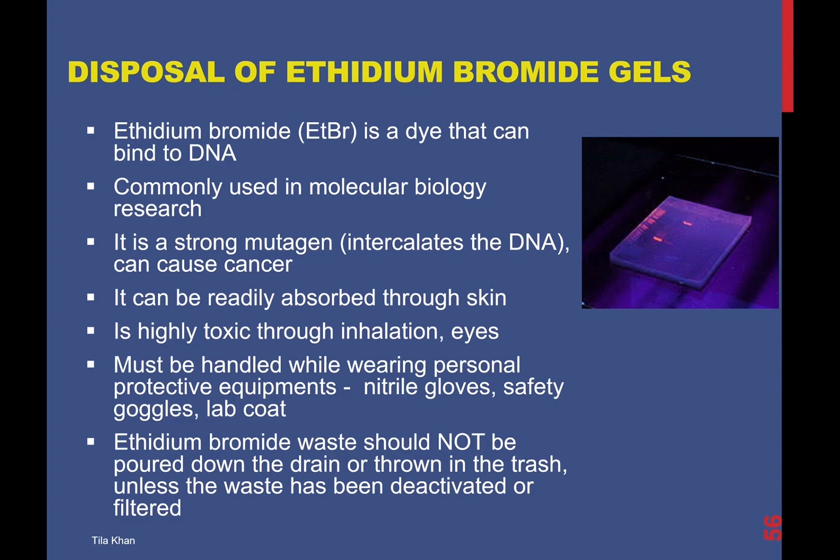Ethidium bromide waste that will come out after your gel is run should not be poured down the drain or thrown in the trash unless the waste has been deactivated or filtered.